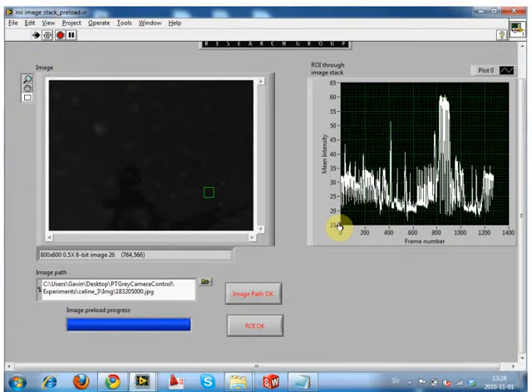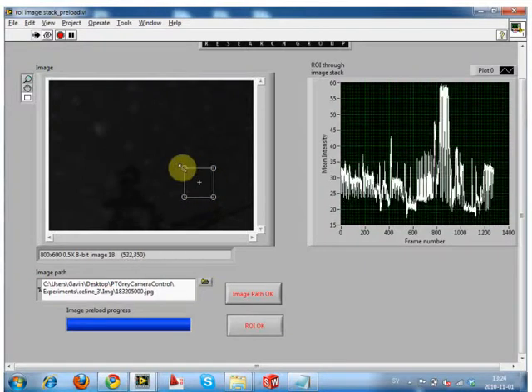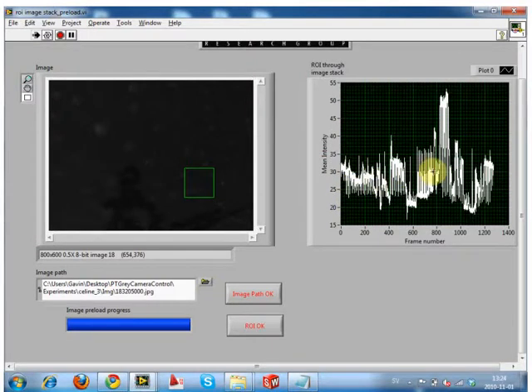There we go. A lot of these upper pops here, going down to 0 values, probably aren't there. In fact, there's probably lots of them in the sequence, and the data probably isn't this bad. It probably is a lot flatter in regions, and then of course there's going to be some spikes. Let's choose a bigger region. These things probably don't exist. This is probably just an artifact of the numbering scheme always going back to a lower number, because there are so many files.